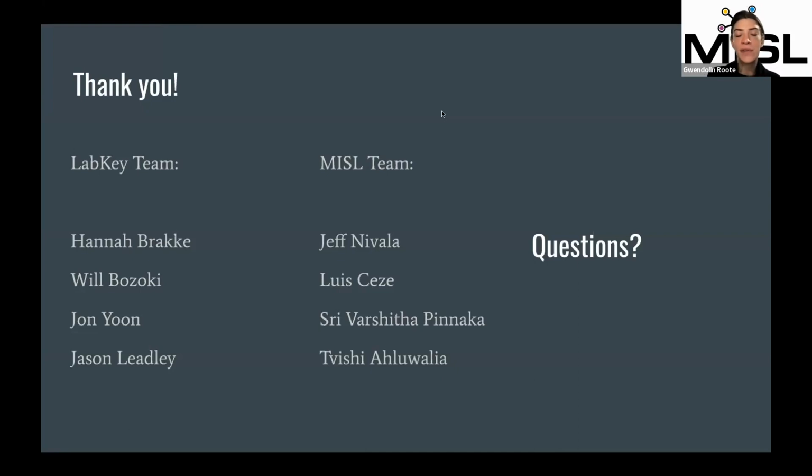And then for things that were what I would call MISL samples, ones that we created ourselves, where someone did some kind of chemistry to make the sample and then stored it in an Eppendorf tube, I put the responsibility on the researchers themselves to put anything that they want to keep for the long term into LabKey and get a barcode on it. So I wouldn't call it an ultimatum, but I gave them some work.